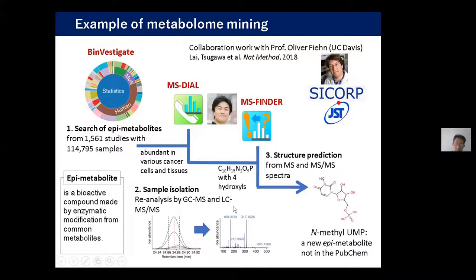In the GC-MS step, we applied derivatization. In the derivatization process, a trimethylsilyl chemical group is attached to a hydroxyl group, or exposed oxygen, in the molecular structure. So in order to confirm molecular structures, we can count the number of derivatized positions to see the number of exposed oxygen in the molecular structure.